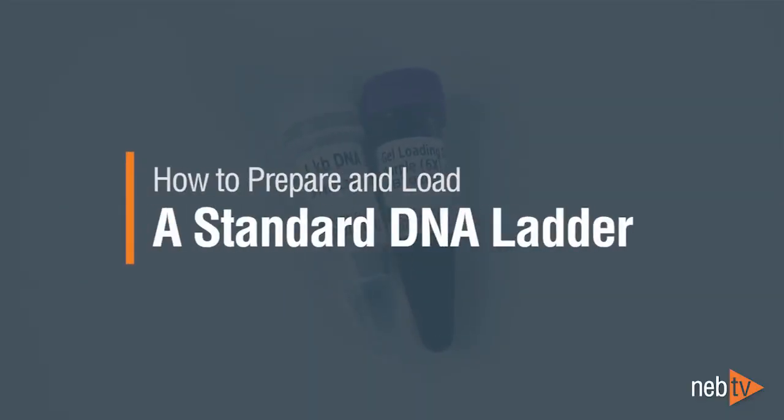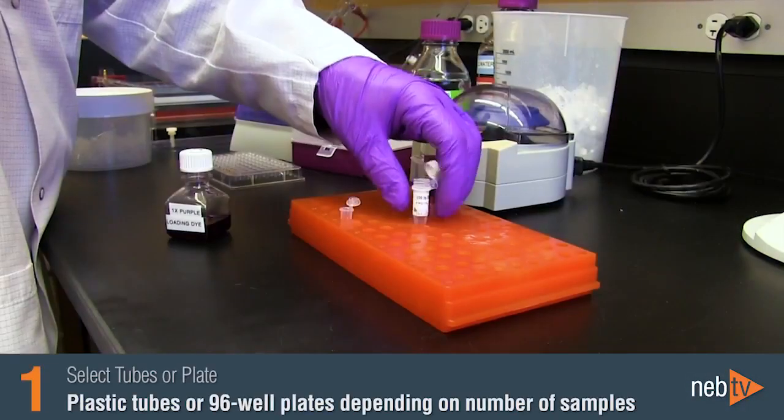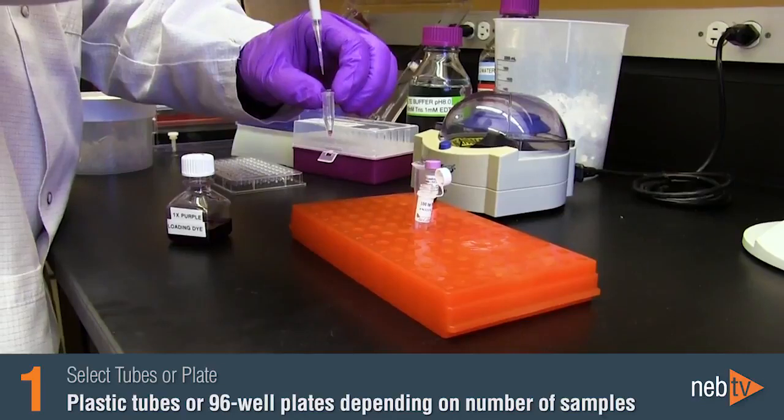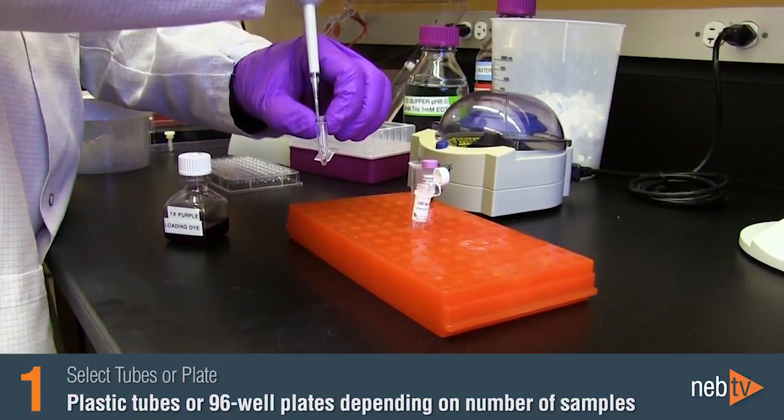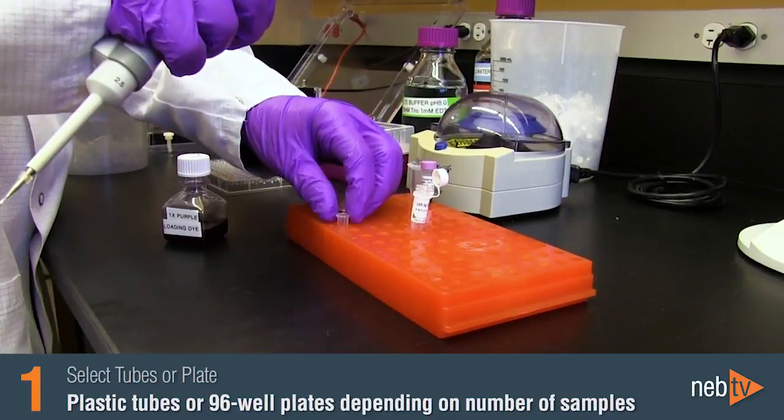In this video, I will demonstrate how to prepare and load a standard DNA ladder — one that does not come in a ready-to-load format. Because standard NEB DNA ladders are concentrated DNA solutions, they need to be diluted and a loading dye should be added prior to loading onto a gel.